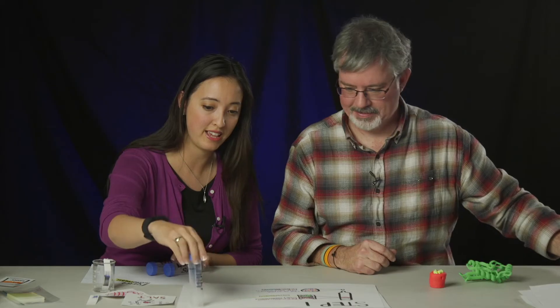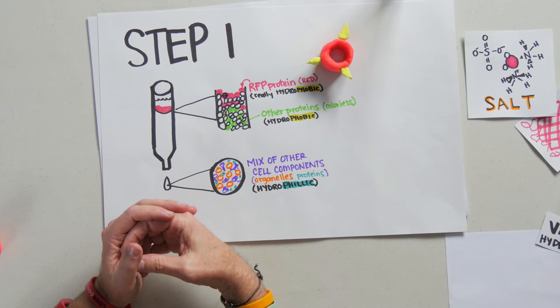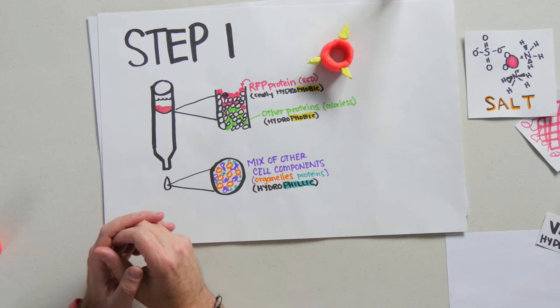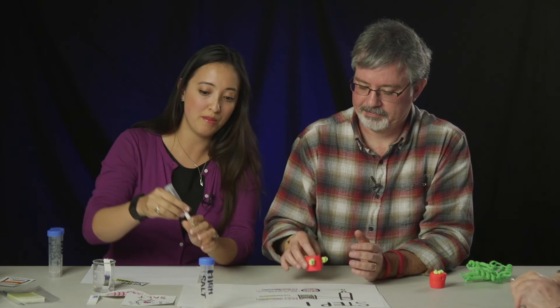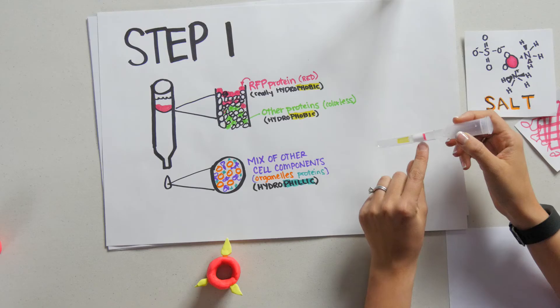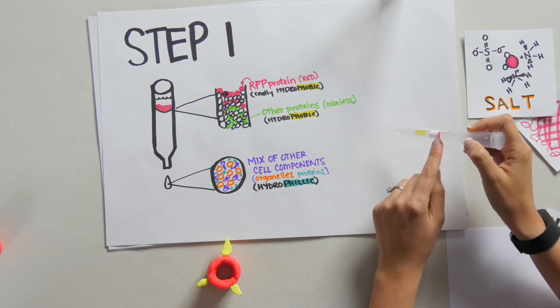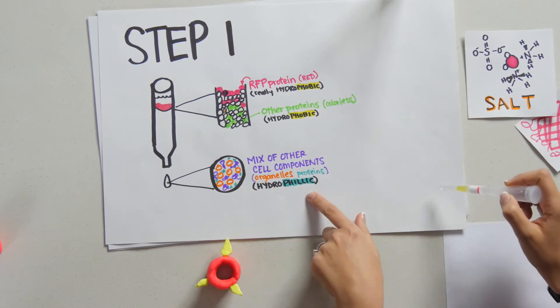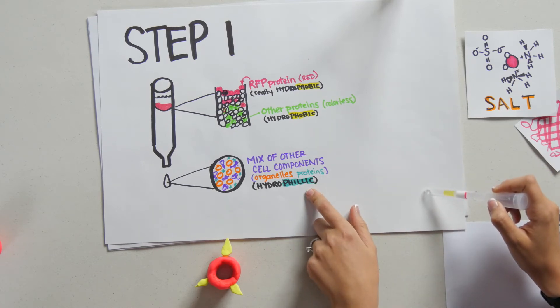The first step is that high-salt. So in the high-salt, we have this red fluorescent protein. And this is going to change the conformation of the protein such that those hydrophobic groups pop out. And we can now have them interact with that hydrophobic resin of the column. So as you can see in our column, we've added our mixture to the top. You can see that the red is stuck here at the very top, it's interacting with those beads, it's sticking to the hydrophobic beads because it's hydrophobic too. So the stuff that's coming out the bottom will actually be really hydrophilic. So this is a way, using high-salt, to get rid of hydrophilic proteins from our mix.